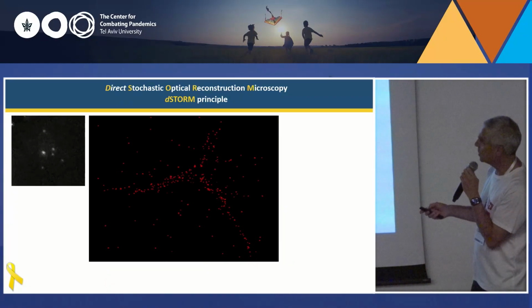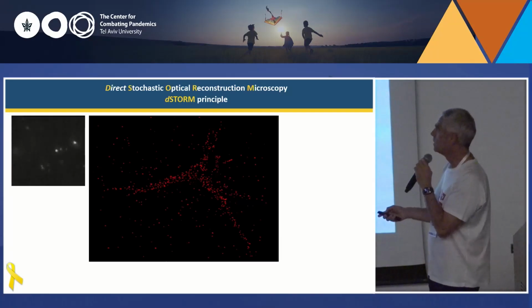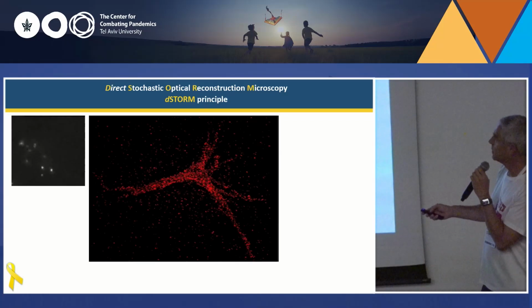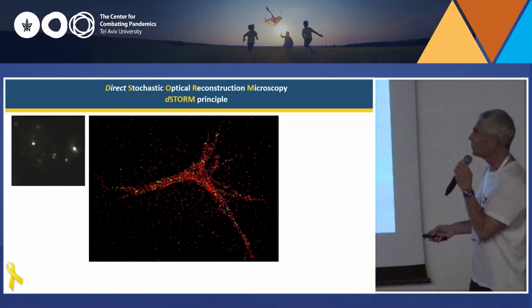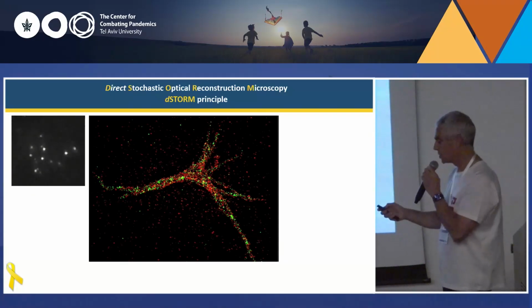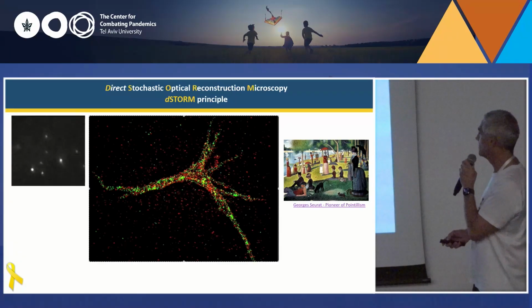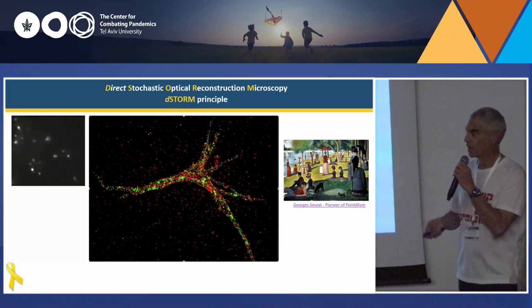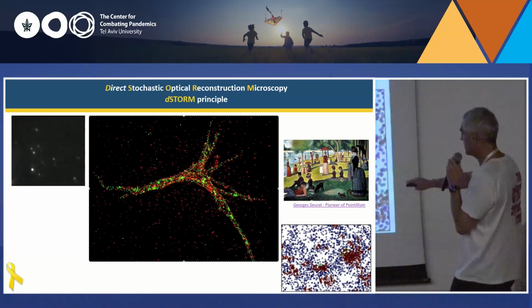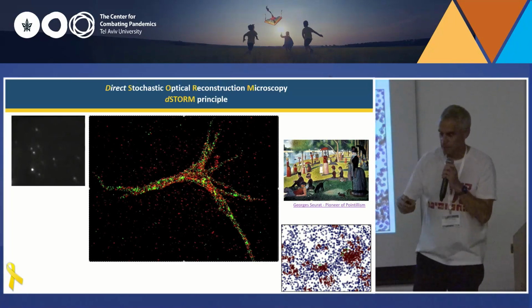And I'll show you here another movie that shows you a bit more detail. These are blinking molecules that you can see slowly accumulating here. And here comes now a second color, so you can do 2 colors. And basically, you can create a very nice image. In a way, you can say that this is a modern pointillism, similar to maybe what George Seurat did 100-something years ago. But for us, at the end, this is our end product, and we need to make some sense out of it.